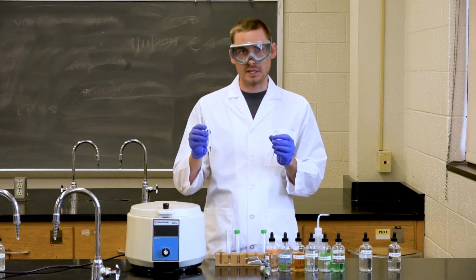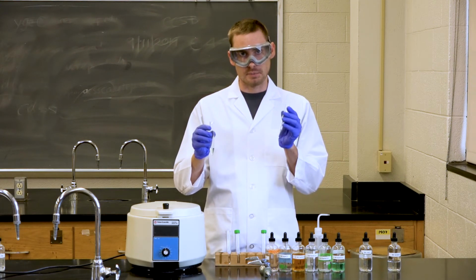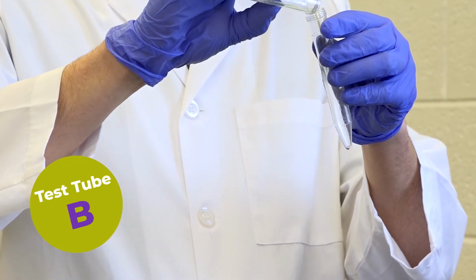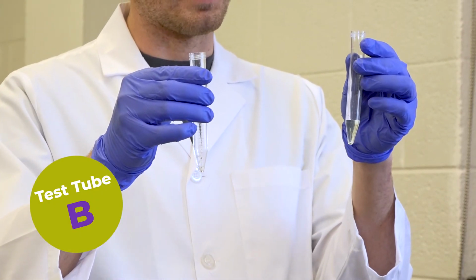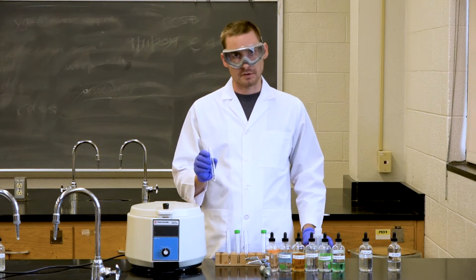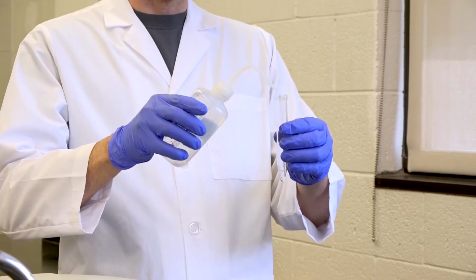So now that we've separated the liquid from the solid, we can very carefully decant the liquid into a separate test tube. We'll label this test tube B. So if you're careful, you should have just solid in this test tube and the remaining liquid in this test tube. So to the test tube with the solid in it, we're going to add about 30 drops of deionized water. This is somewhere around 3 to 4 milliliters.